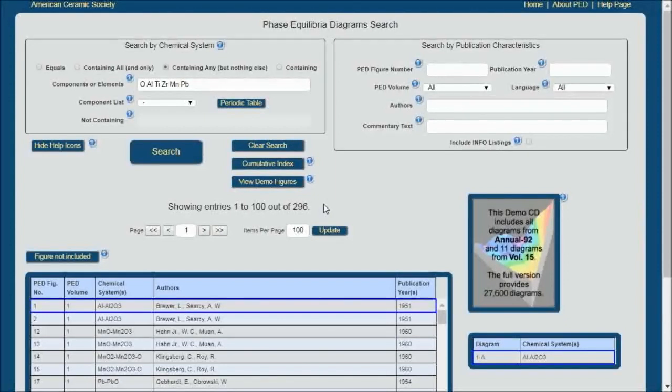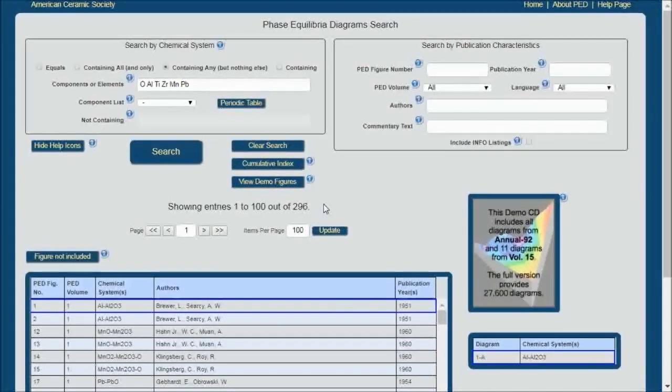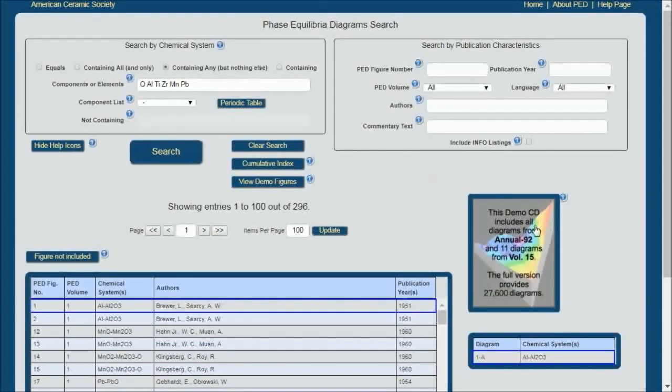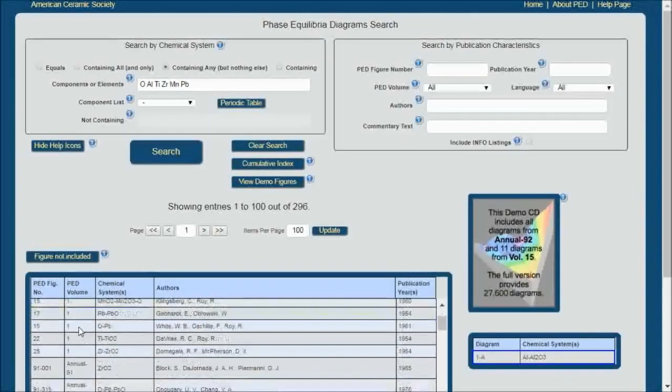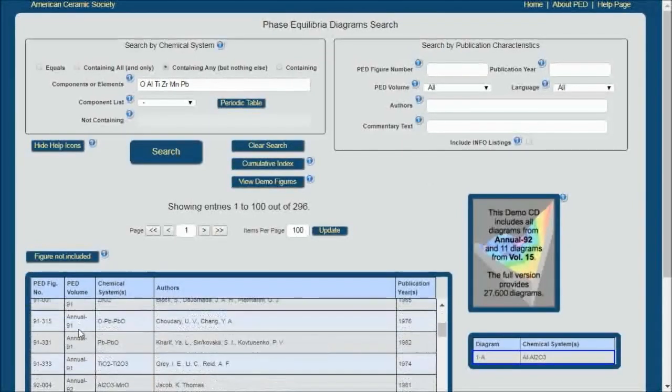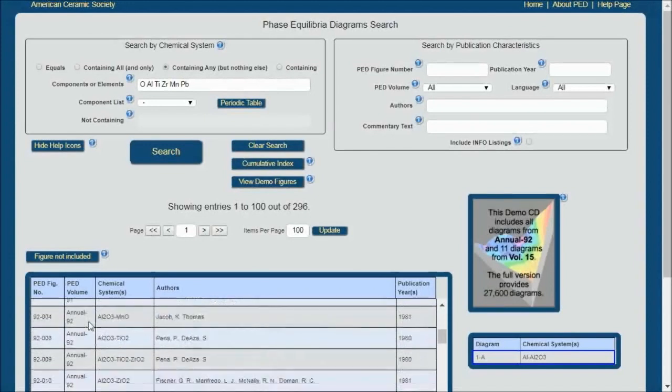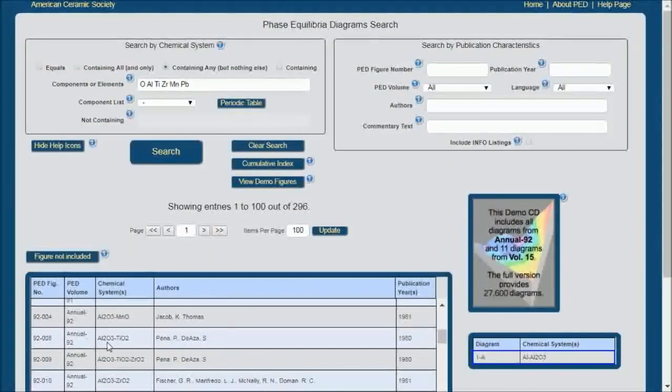You can see where having that ability to limit can become quite useful. As I mentioned, this demo has a limited database, and so I'm going to choose something from Annual 92. We'll just scroll down here, and you'll see Annual 92.